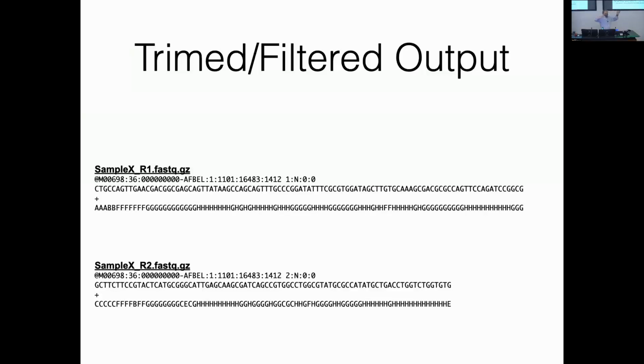intergenic, intronic, exonic, at the junction of an intron and exon, or at the junction between exon and 5' UTR, 3' UTR, right? Especially for DNA-seq, you're just randomly shredding the genome, and so there's no biological significance to the length of the fragment.